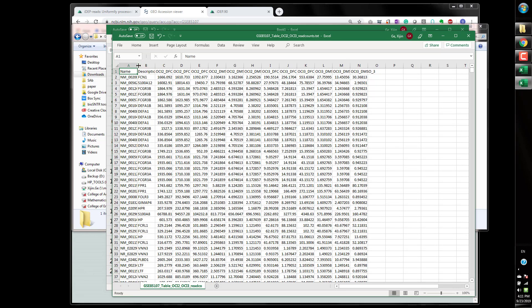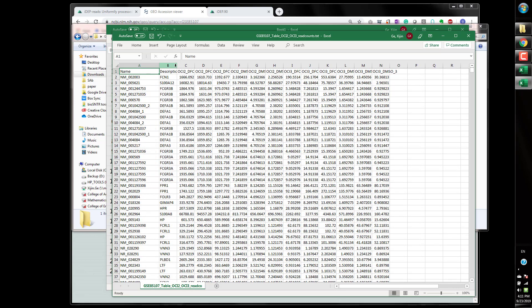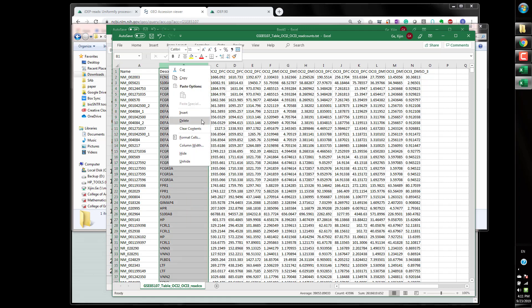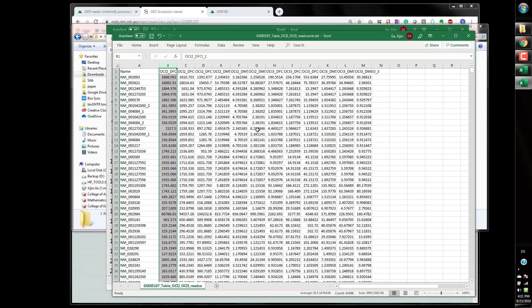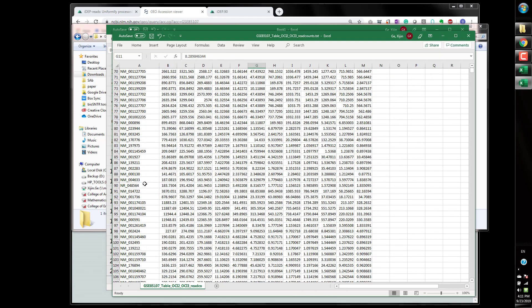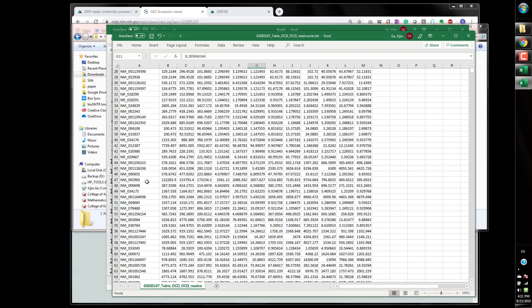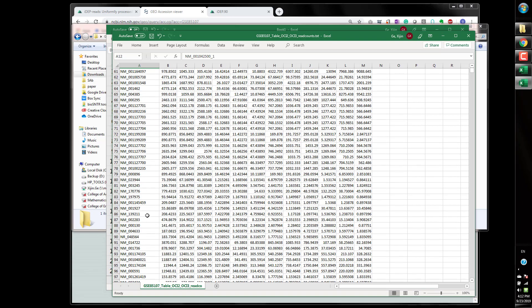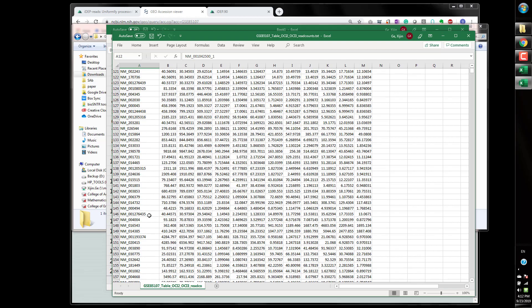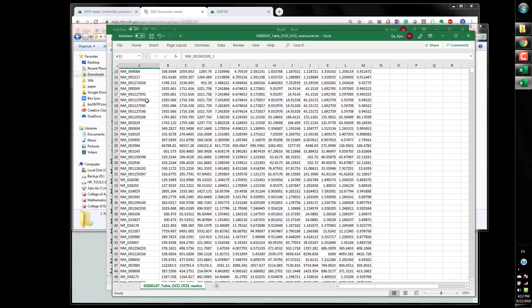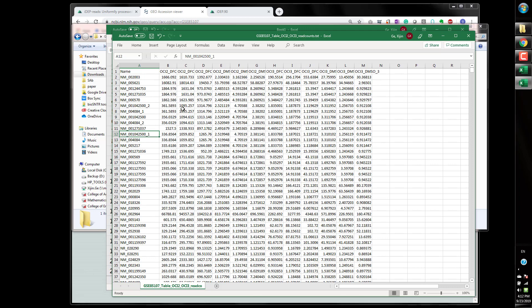And then from here you can see different authors have different formats. In this case the authors have reference gene IDs and also the gene symbols. If you want to use the reference gene ID you can delete that and make sure that this is something that is a gene ID that iDEP can convert. The only problem I see here is that for one gene there's a few transcripts maybe or isoforms here, these guys iDEP will not recognize but I don't think there's a lot of them.